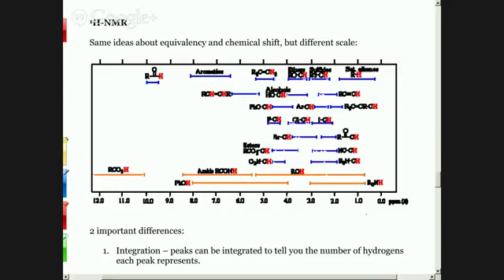So if you see, for instance, let's look at this side where we have hydrogens connected to a carbon that has a halogen on it, either I, Br, Cl, or F. You can see that depending on which halogen it is, that peak is pulled farther and farther up the scale, which is to the left on the spectrum. So we go from 3.1 to the middle threes all the way up to the fours with the very electronegative fluorine, which means that that fluorine is pulling those electrons away from the nucleus, de-shielding the nucleus, so taking the shielding away from the nucleus.